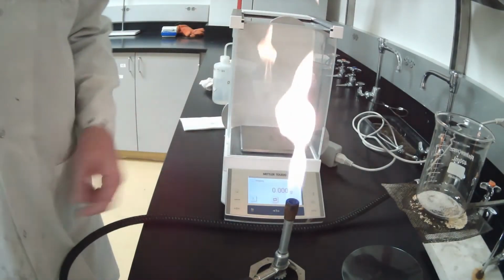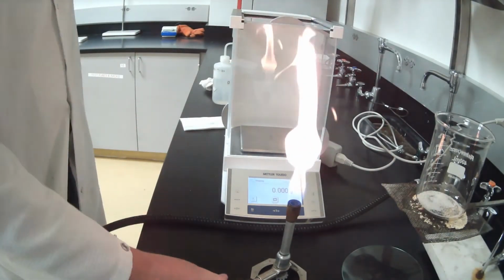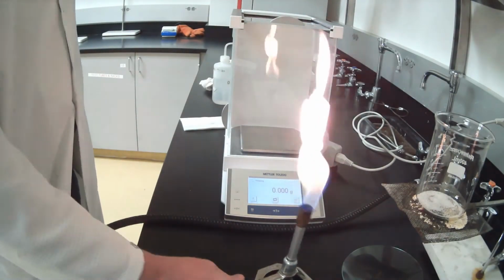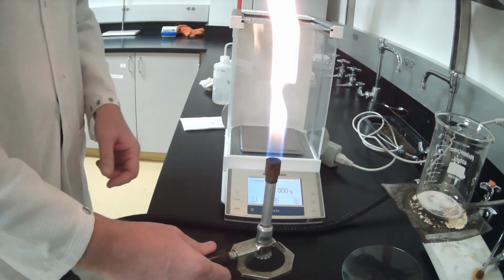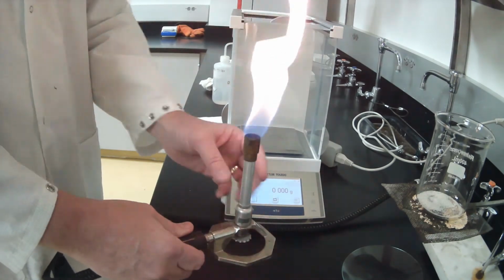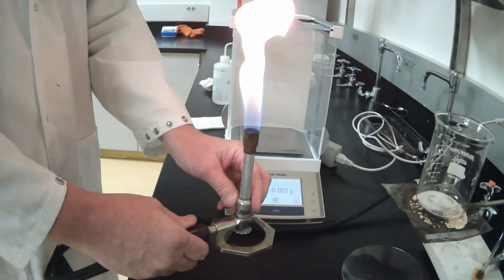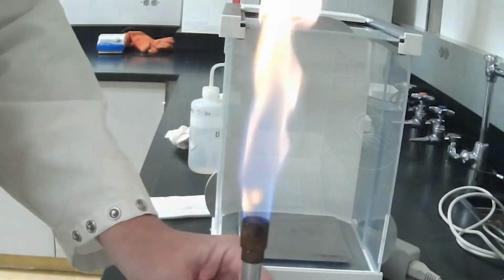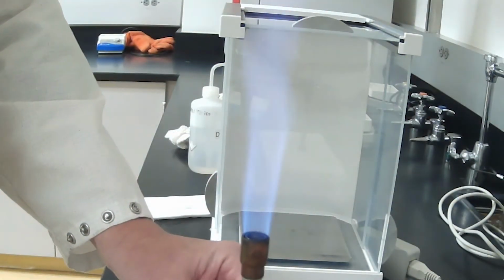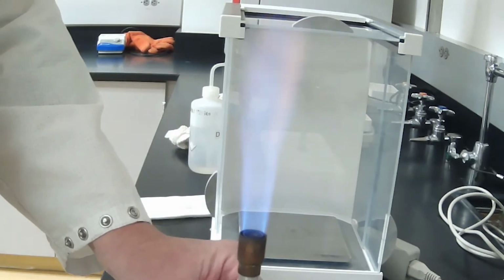You have a bright yellow luminous flame. This is not the flame we want because it'll put charcoal and soot all over the bottom of our beaker and change the weight. Now we're going to adjust the flame. First I'm going to open up some air. As I open up some air, the yellow flame diminishes and it goes to a bluer flame.